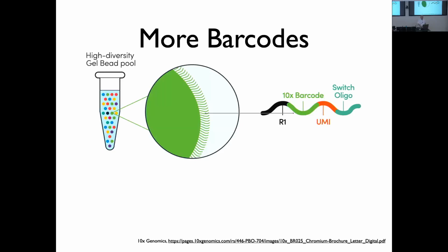And so the UMI allows you to look and see, okay, I know that this read is from glucose 6-phosphate dehydrogenase. I know it's from cell 3024. And are all those reads from different RNA molecules or the same one? I can look at the UMI and say, okay, I'm seeing these 3 different UMIs across the 1,000 reads from this gene. And so I know that I'm just going to group those into 3 different RNA molecules. That makes sense?